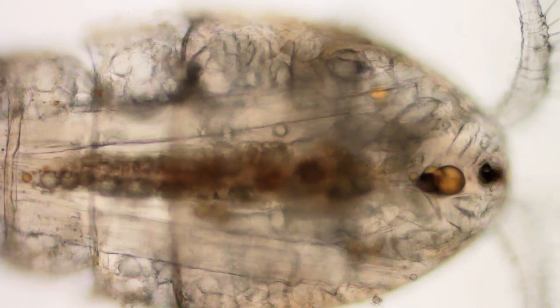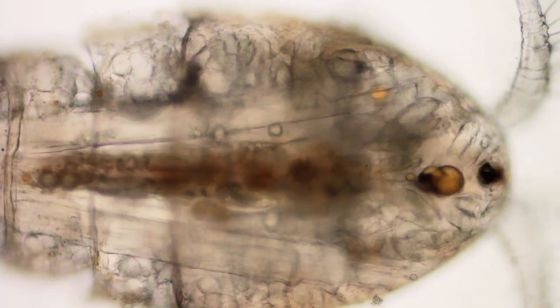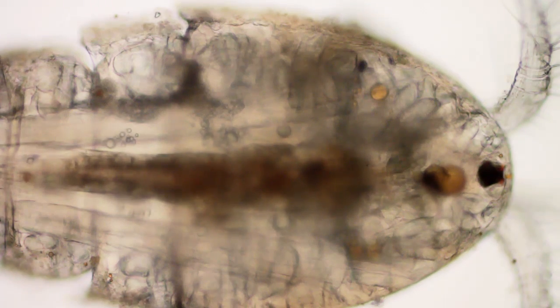Fascinating. She seems to have less growth on her shell than other ones that I've seen. Some of them are covered with vorticella colonies growing right on their shell. I wish I knew more about their structure — I'd like to know where the brain is and what some of these round things are. I've never seen them inside of one before.